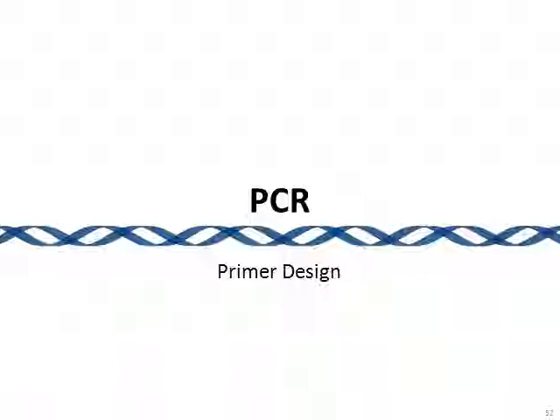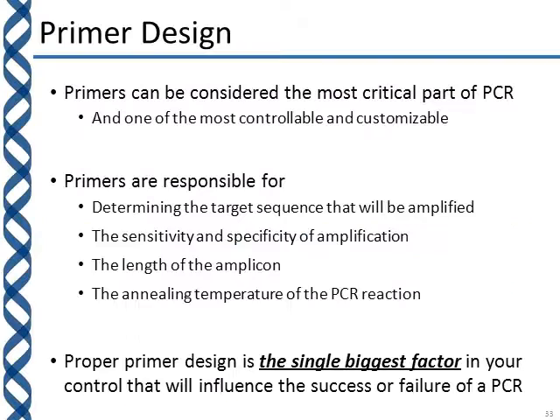So now let's take a look at primer design. I like to think of the primers as one of the most critical parts of the PCR reaction. In reality, all of the components are equally critical, because your PCR reaction won't work without all of the components in the mix. You need the polymerase, of course.